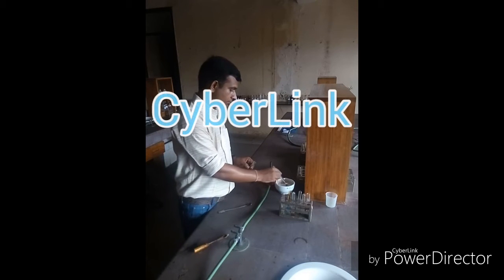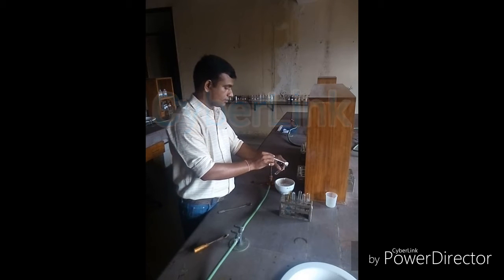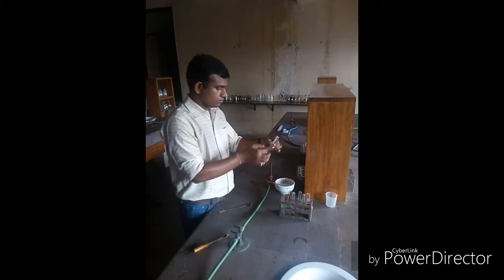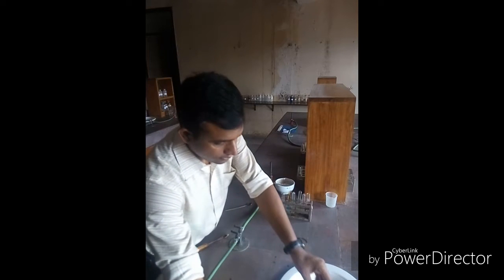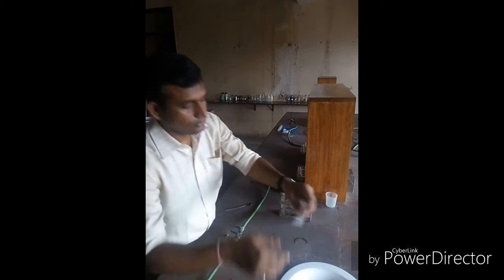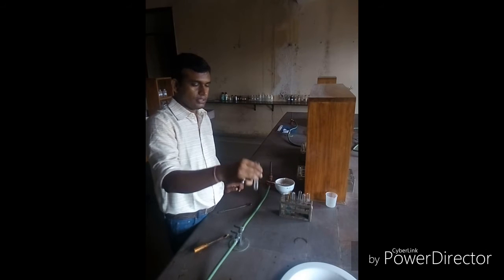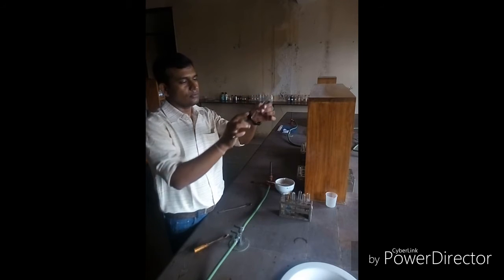In the clean and dry test tube, put a very little amount of salt, say 0.5 gram or less. After taking the salt in the test tube, add a quarter test tube of water to it and mix the salt with the water. You will then see a clear solution is made, which is known as the original solution.